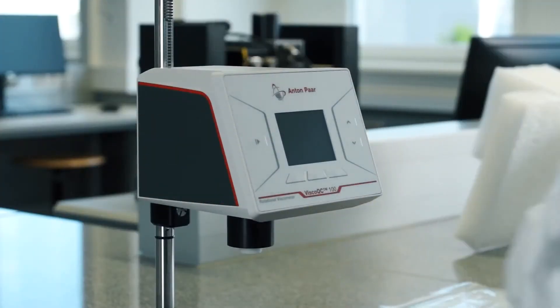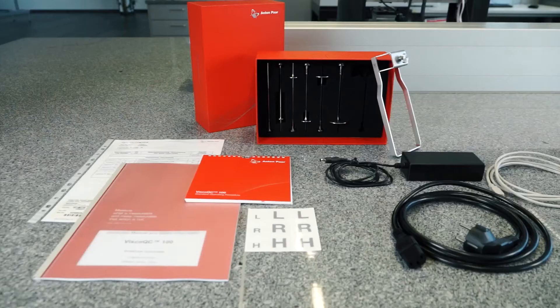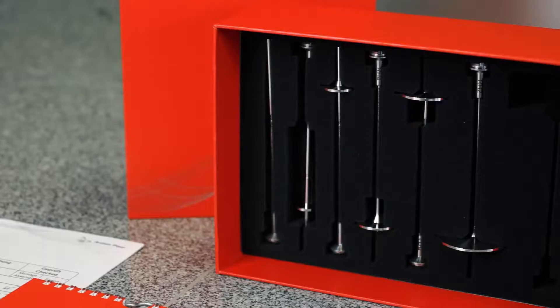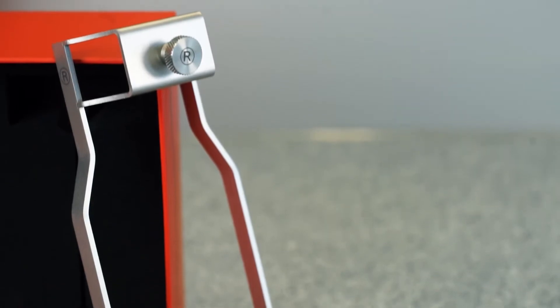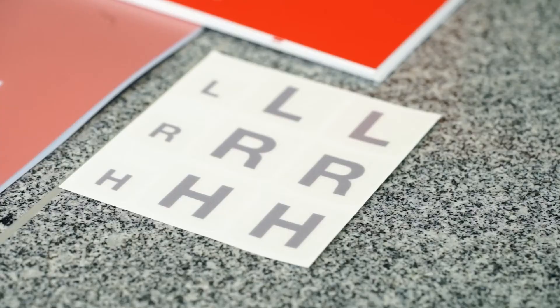The instrument and SOP shown here is for the R model. It comes with all necessary cables and, depending on the model — L, R, or H — with either four or six spindles, with or without a spindle guard, a user manual, a print version of the SOP, and stickers to mark your Visco QC100 as either L, R, or H depending on the torque model.